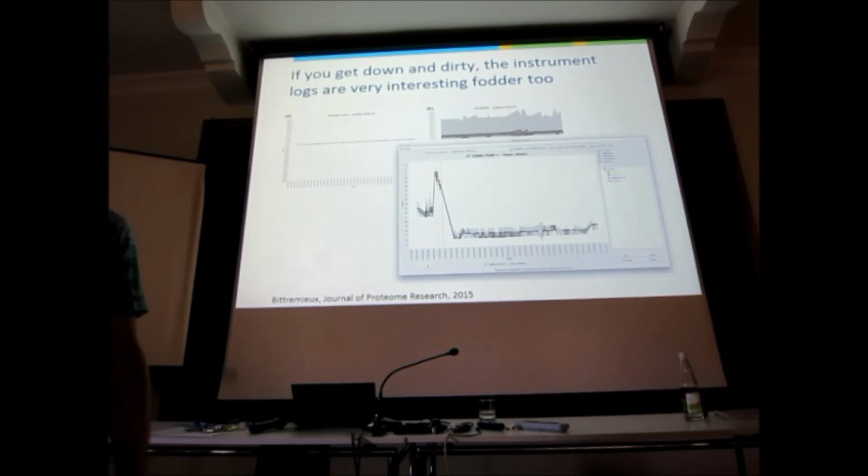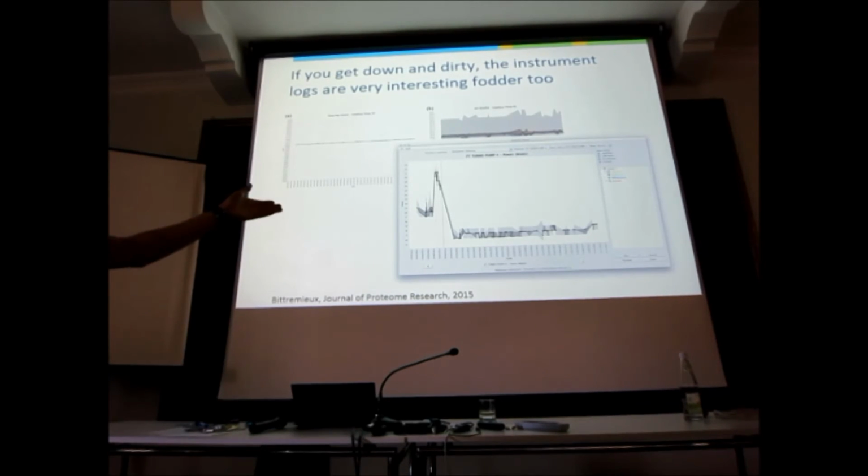power consumption is low. But imagine, you know, you want to do professional proteomics? Monitor your instruments. When you see this go up, shut it down, call the service guy, says fix it before it's broken. Right? Or you can see when your columns start to degrade. You can see when maybe this sensor is starting to degrade. Why don't we do that kind of stuff?